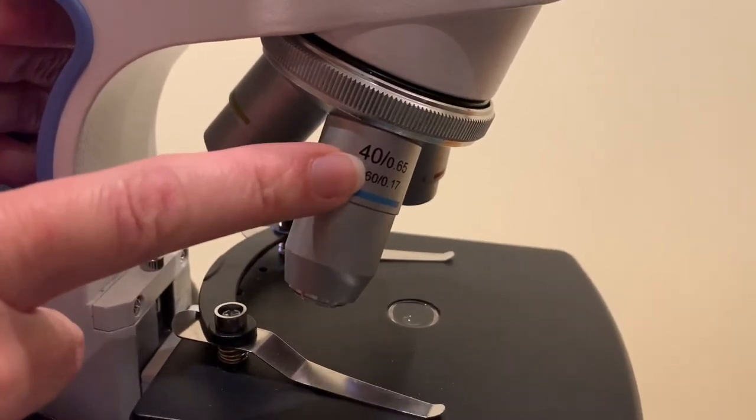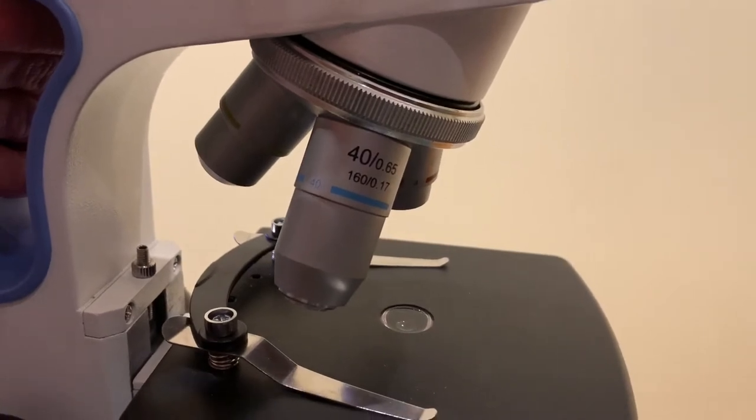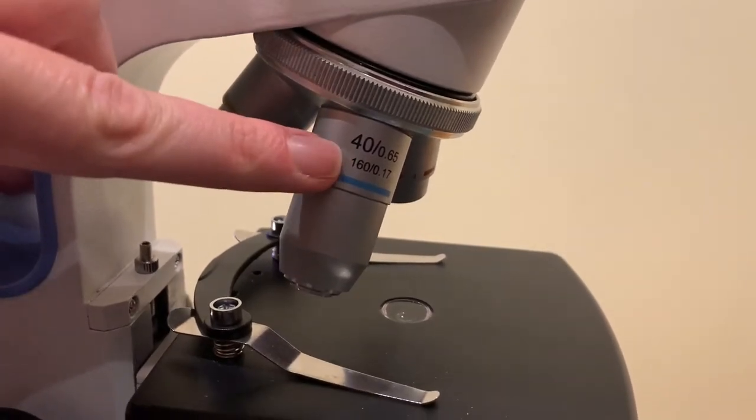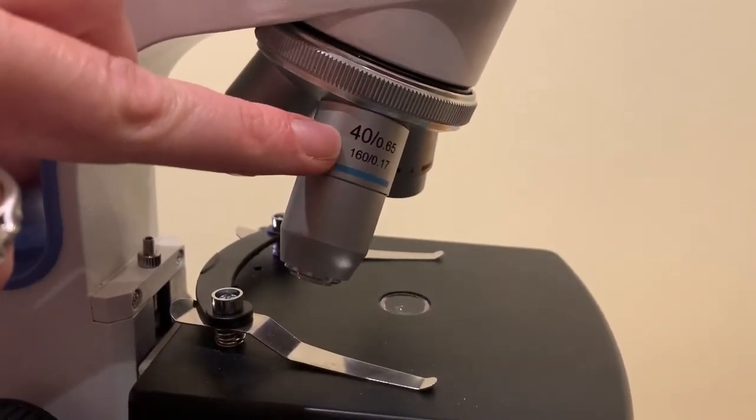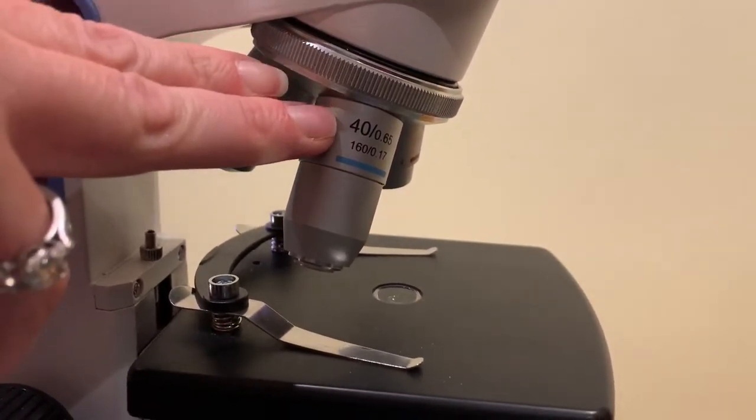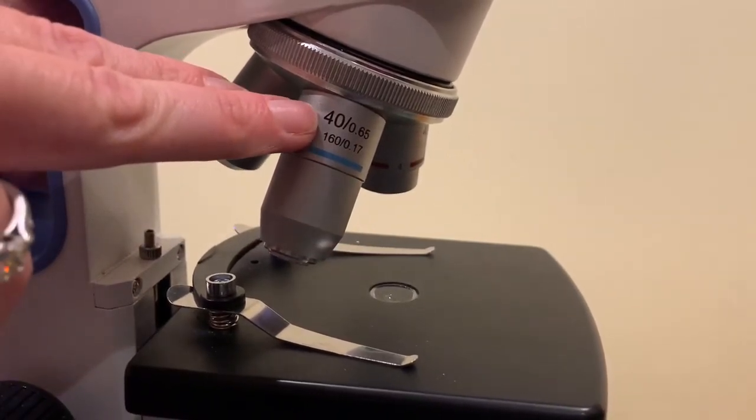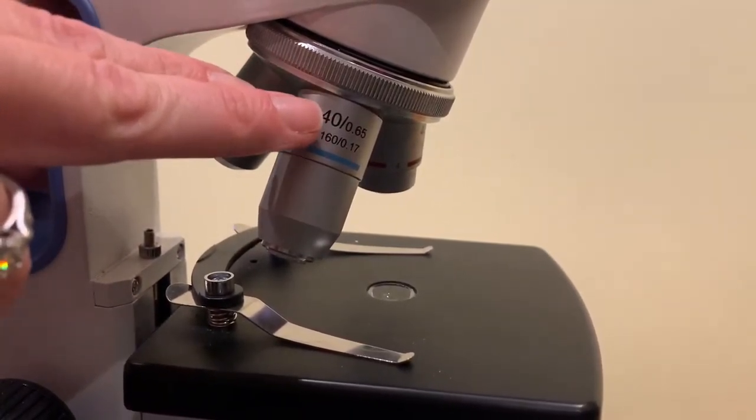Combining this with the 10x of the ocular lens we would do 10 times 40 is 400. So when you're using this microscope and you are using this objective lens to look at your sample, your sample will look 400 times larger than it does with the naked eye.